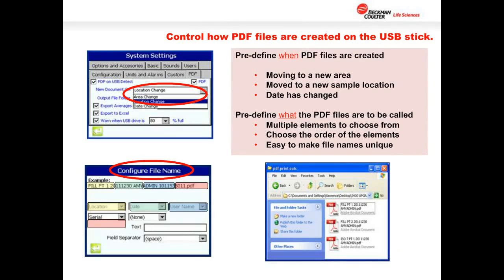And that's possible today with some of the instruments that are on the market, like the Met One 3400, for example, which provides that kind of capability and the ability to set up files and structures that could flow directly into a LIMS system.